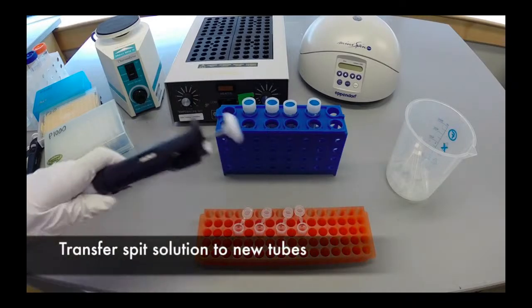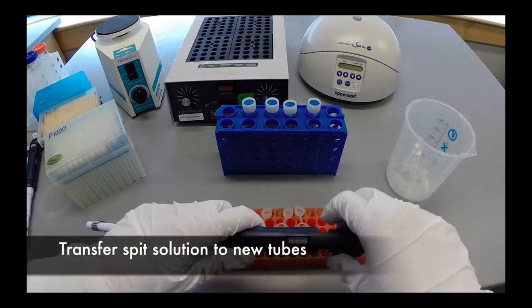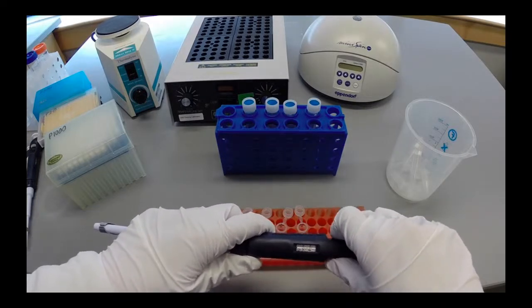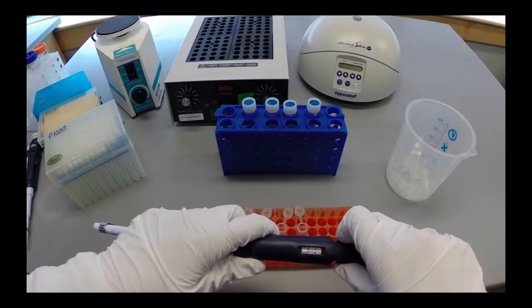Using the P1000 micropipetter, 500 microliters is transferred from each spit collection tube into a new microcentrifuge tube.